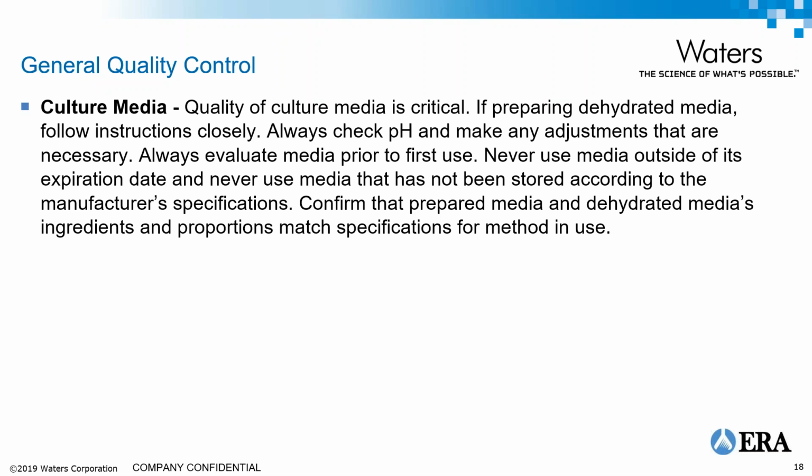Confirm that the prepared media is actually made to the appropriate recipe in the method. Generally, this should be taken for granted, but you may want to double check. Make sure that the manufacturer is actually following the prescribed recipe.